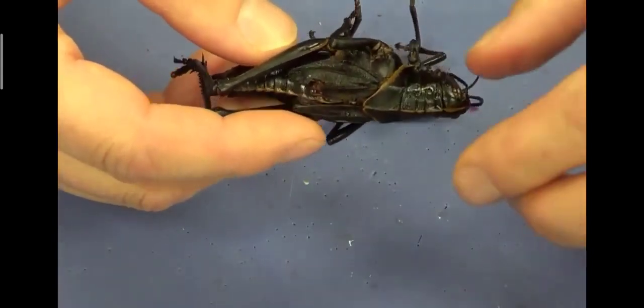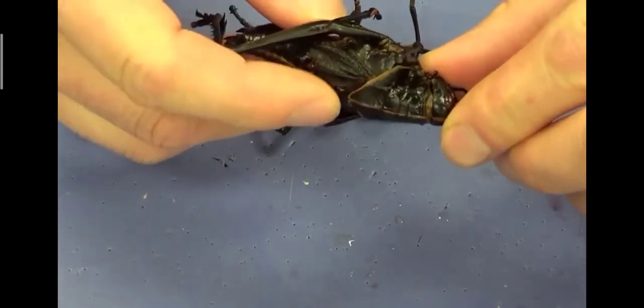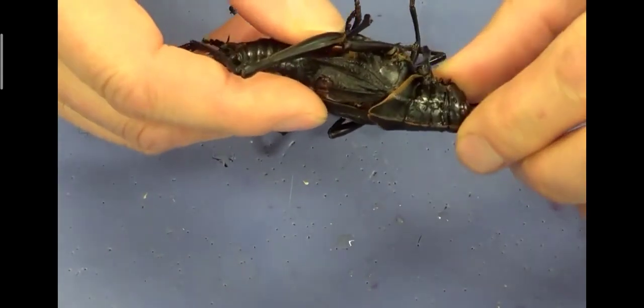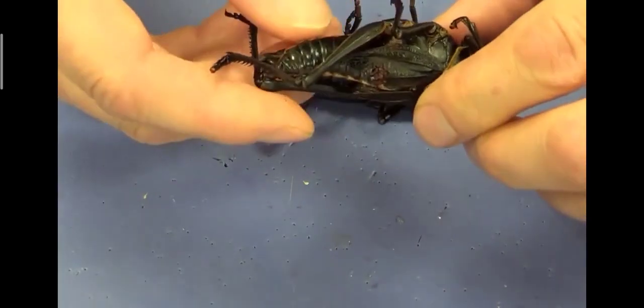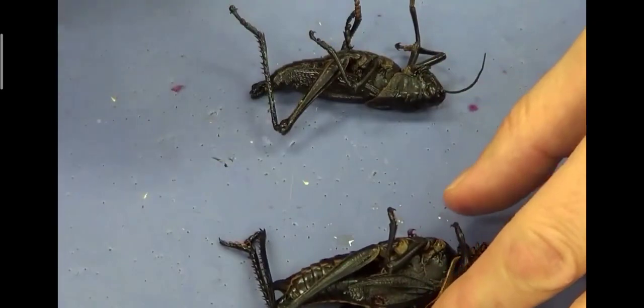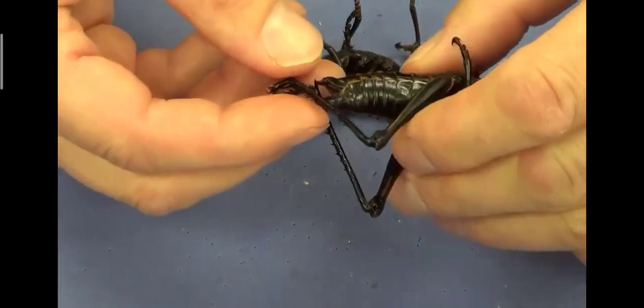Okay, now you can see that the body of the grasshopper is segmented. Now this segment is termed the head, the middle one is termed the thorax, and the last one is termed the abdomen. Okay, now these legs you can see. Okay, now you can take it apart for dissection.